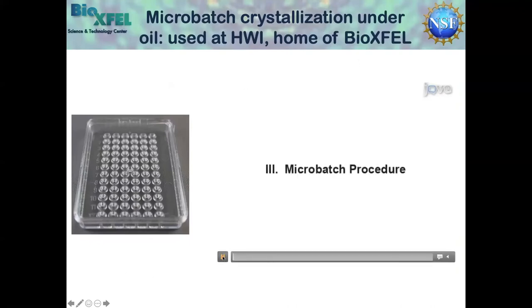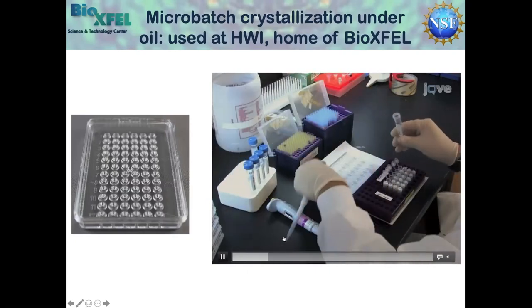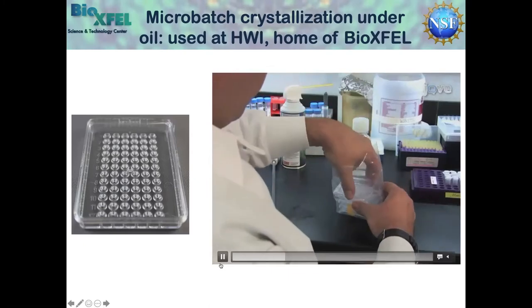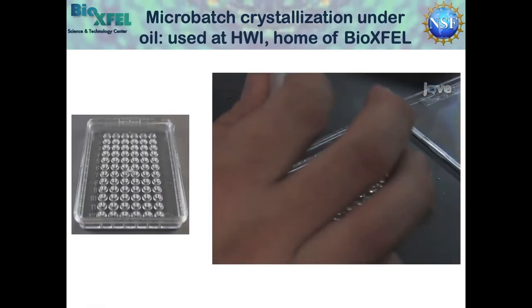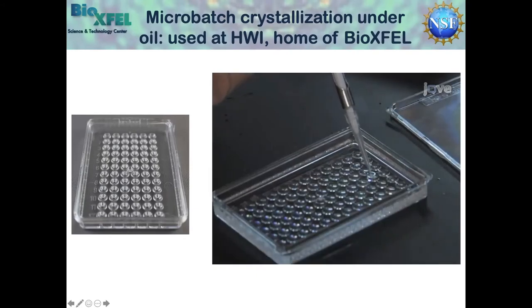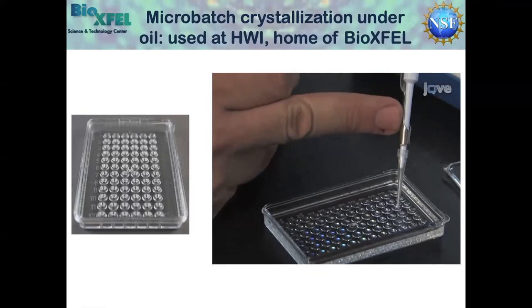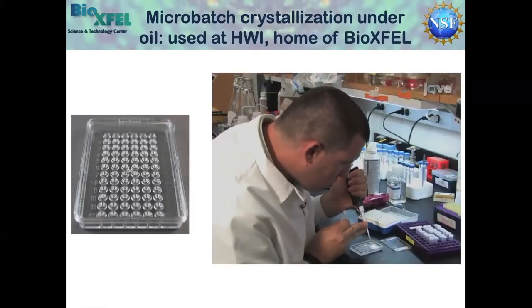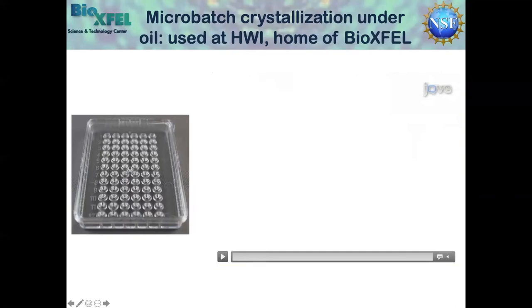The micro batch method involves the use of an oil layer. You'll see here they're dusting off the tray to make sure there are no contaminants or particulates. Now they're layering on 100% paraffin oil — fill it up, then gently pull off the excess oil and leave that layer such that the indentations are underneath it. Then gently place the precipitant at the very bottom of the drop and layer the protein directly into it. These sit under the oil with minimal diffusion, and you monitor them the same way with the same kind of notes. This is the crystallization technique used for the Hauptman-Woodward Institute crystallization center that Dr. Bowman will speak about.